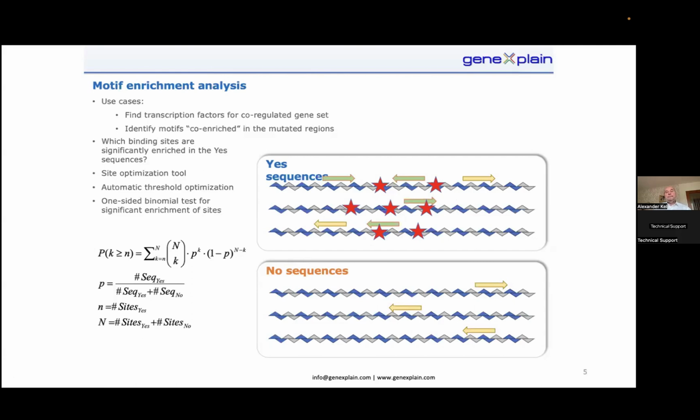And that's why this whole region becomes changed. And this again can lead to a change of regulation of the corresponding gene. So it's very important to look not just at single binding sites for transcription factors, but at regions which are occupied by many mutations. And actually what we see, and you will see it online, is that very often those mutations are clustered. They are not evenly distributed over the whole genome, but you clearly see clusters of mutations.